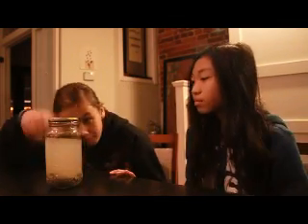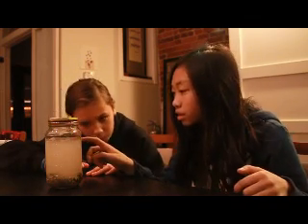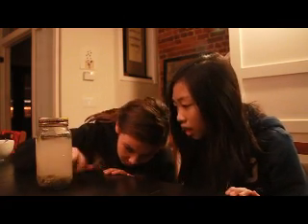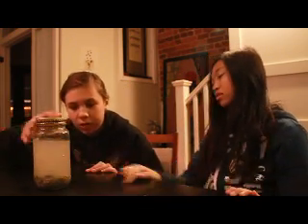Okay, so we're now back at the lab. First we should figure out what's inside it. Well, there's obviously water inside of it. Yeah, and there's oil you can see at the top. There's actually a lot of oil up there. At the bottom, actually, there's sand. And there's a lot of pebbles and stuff. We should go write down a procedure or a flowchart. Alright, let's go.